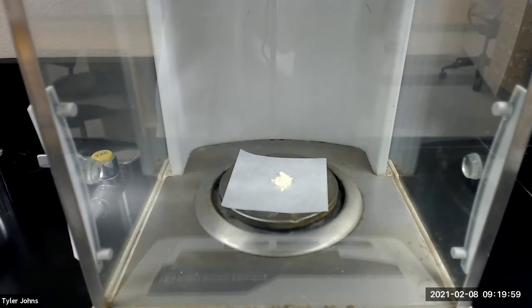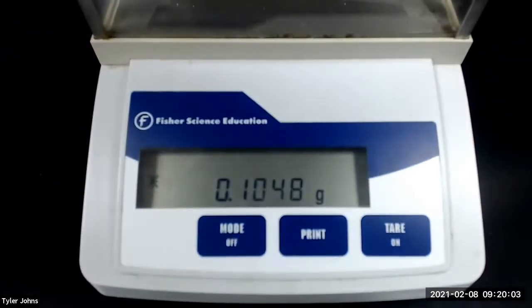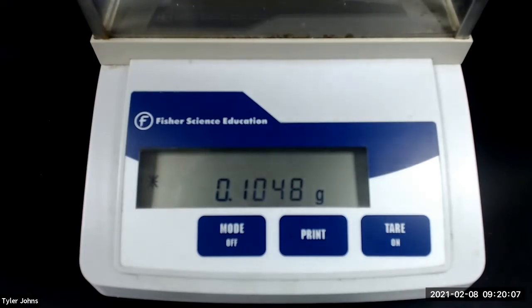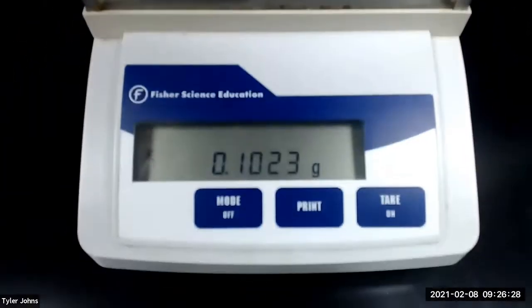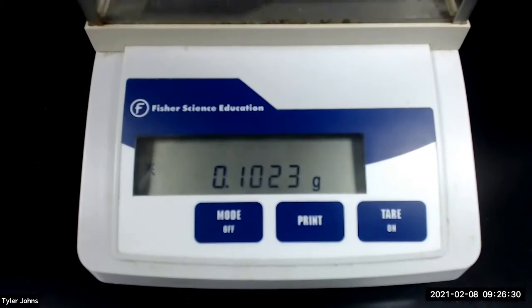The mass of benzil that we will be using is 0.1048 grams, and the mass of dibenzyl ketone that we will be using is 0.1023 grams.